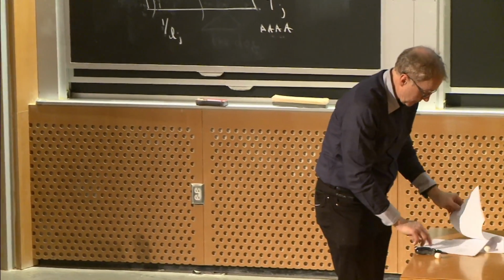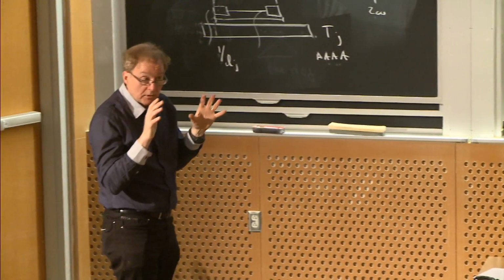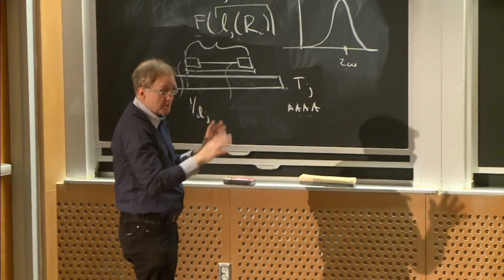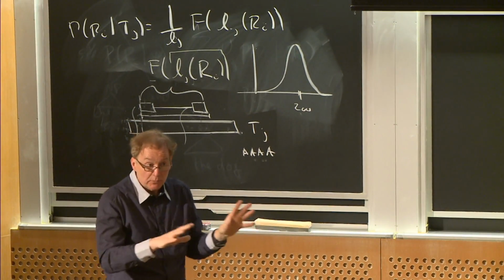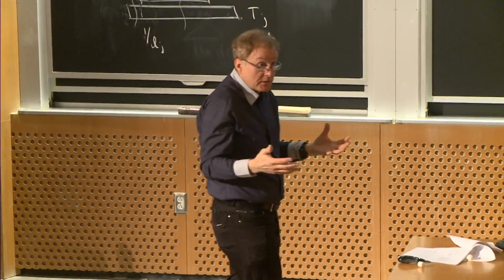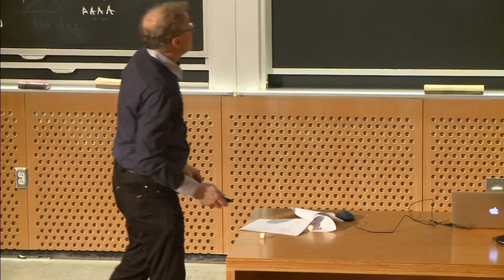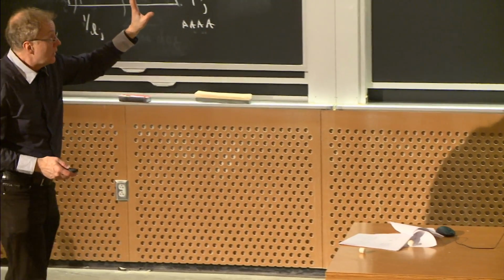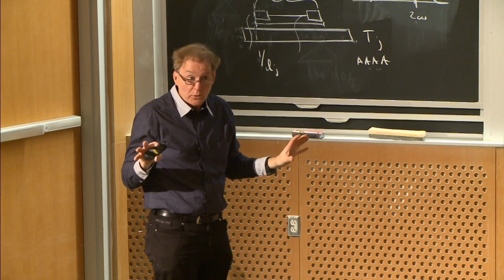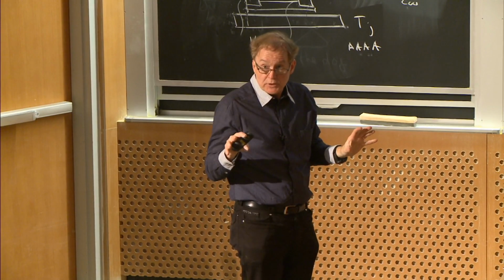Okay, so we've talked about how to take our reads, build a probabilistic model, estimate isoform prevalences, and we know how many reads are mapping to a given gene. The question now is whether or not we see differential expression of a gene in different conditions. So I'd like to turn to the analysis of differential expression, unless there are any final questions about the details of RNA-seq and isoform estimation.